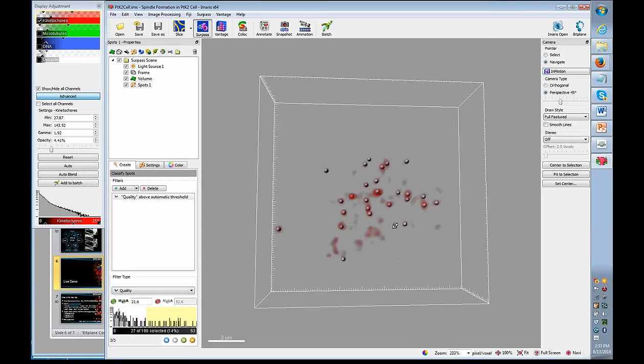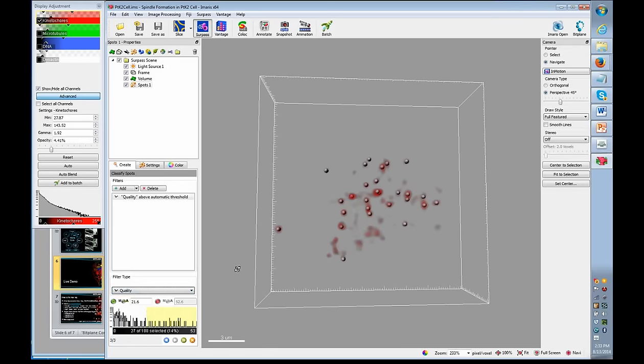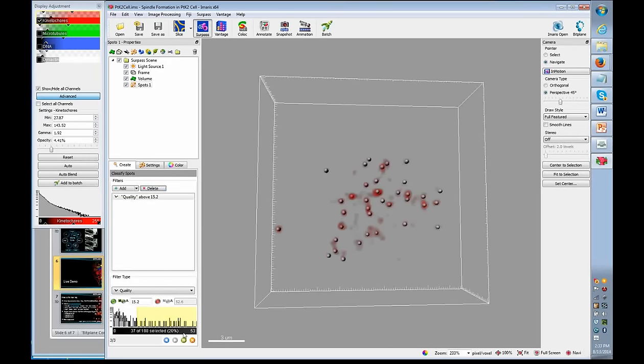There's an automatic threshold, which varies in whether it will work on one image or another. And there are some other approaches the support team can help you with to do automatic thresholding if the initial value does not come up the way you'd prefer results-wise. There are other filters as well if we wanted to exclude objects close to the image border or apply some other filter to include or exclude objects. We could do that and have a whole series of filters here to get a subset of the initial result.